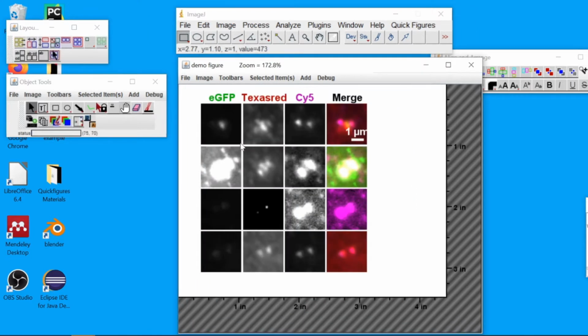In this figure, panels derived from 4 separate images are displayed. For demonstration purposes, I've chosen images in which the brightness and contrast has been adjusted in wildly inconsistent ways. I hope you don't normally make these crazy adjustments, but even when you simply import images into ImageJ, there'll be an auto-scaling that won't necessarily give consistent display ranges to every single image you open.